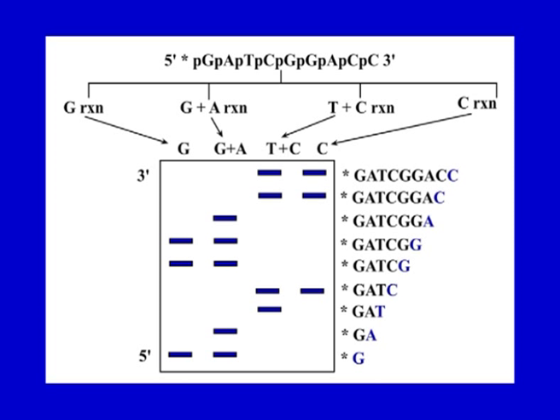So, that is sometimes difficult to see in here. So, that way the whole sequence can be generated except for the first base actually. Now, this was the Maxam and Gilbert method, and it was the preferred method at that time for sequencing, but it is no longer used actually.